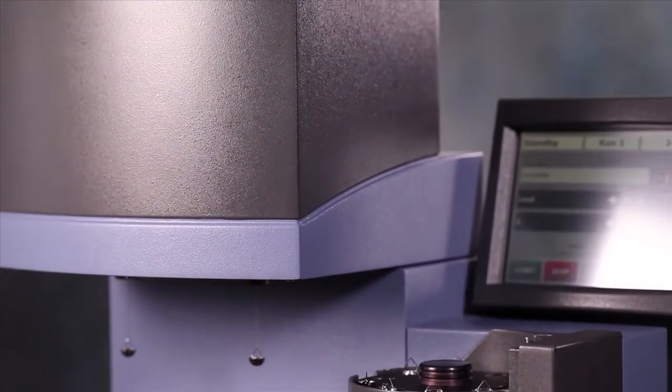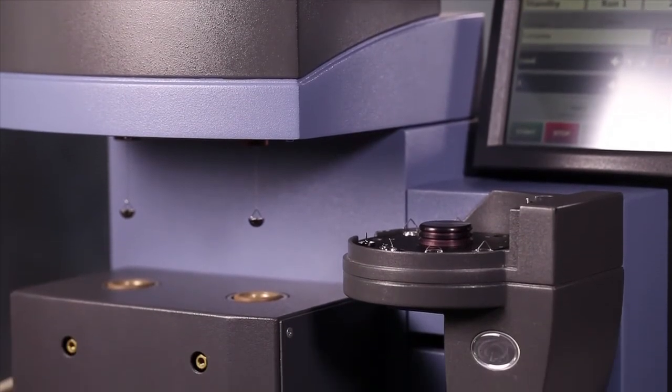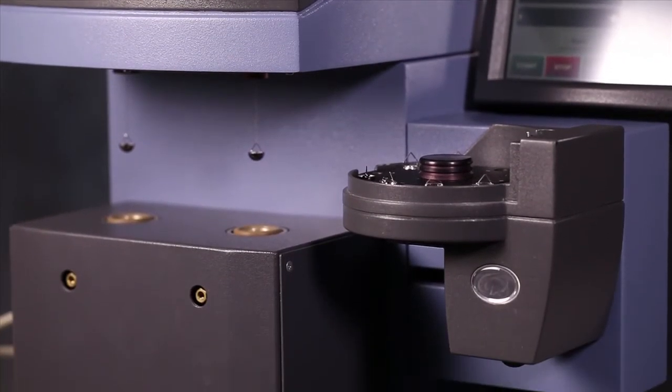A variety of experiments can be performed. A typical sorption experiment includes holding temperature isothermal or constant, and then varying humidity by stepping humidity in increments. Multiple sorption and desorption cycles can be performed.